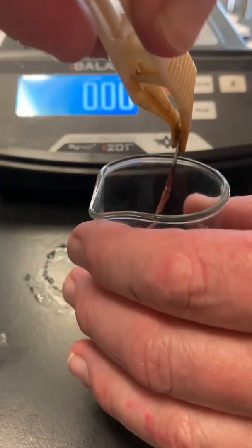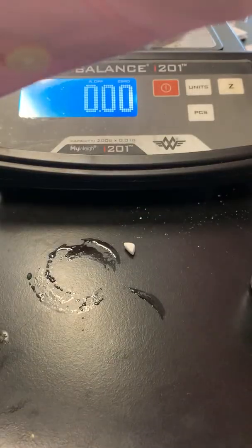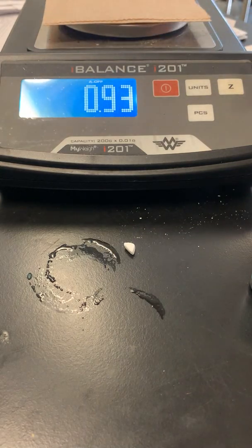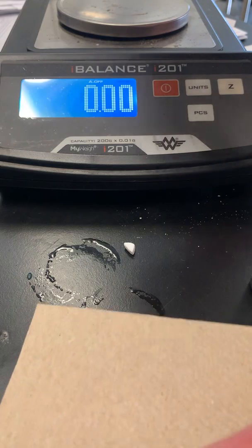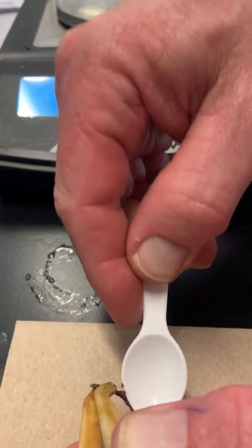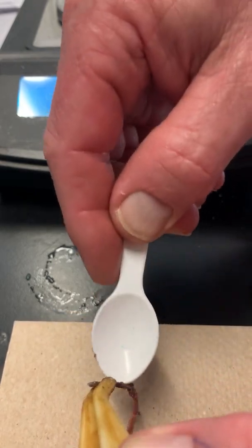And so at the end of 8 minutes, you pull it out, and you have a piece of paper. So my piece of paper weighs 0.93 grams. And then what you do is you push the copper onto the paper.